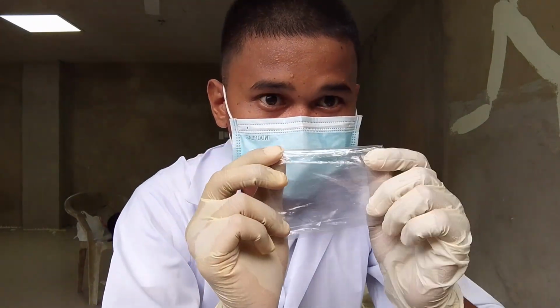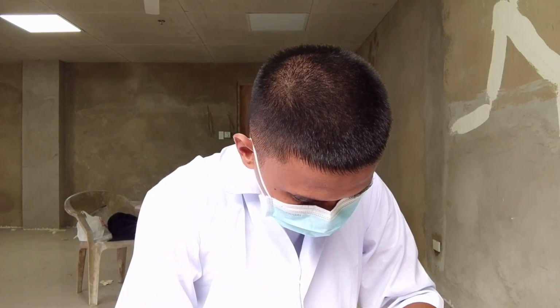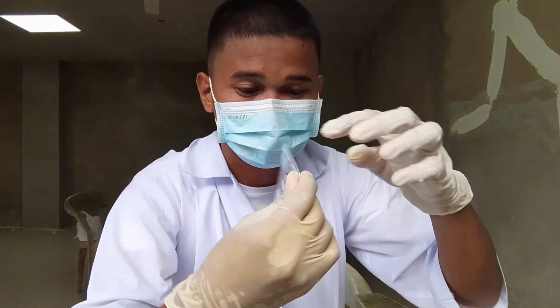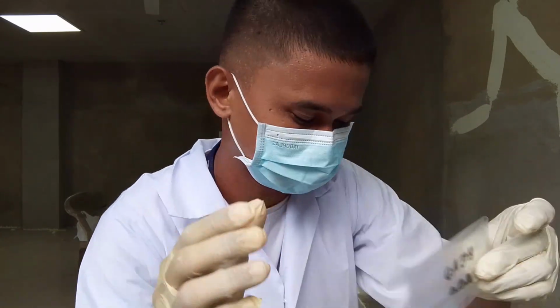After this, I will label it to avoid alterations. I am done with the human head hair, so I will now proceed to the eyelashes.